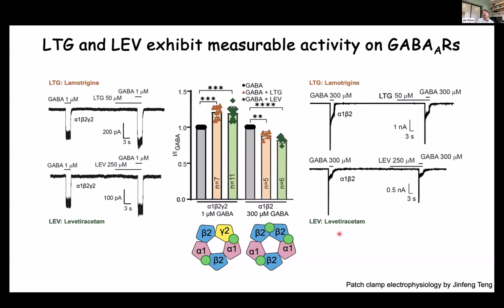Then we checked the compositions. What we found is that if we get rid of gamma-2, we get rid of the alpha-gamma interface from the first part, but we introduce a beta-beta interface, which also had some mystery density. So we think the beta-beta may contribute to the inhibition, and the alpha-gamma may contribute to the potentiation. But from here, the conclusion is still not very clear. We still want to figure out where this kind of drug plays such an interesting role.